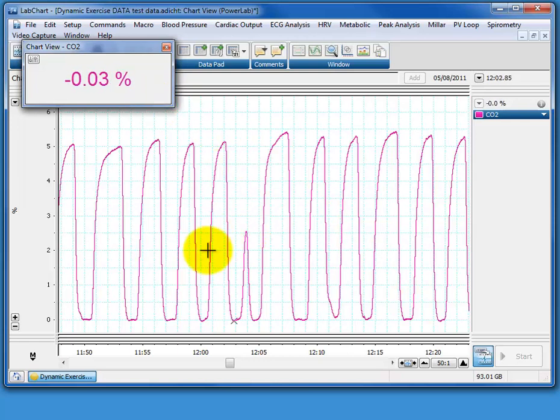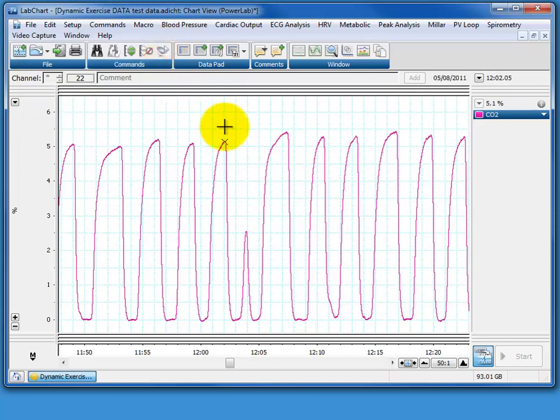So with the system we're looking at now, we're actually going to get a visualization of the end tidal CO2, a graph showing it, and then you can obviously look at the data and interrogate it quite nicely using that. So let's close down that, because we're not going to be typing out all these numbers. What we are going to be doing is adding another channel.